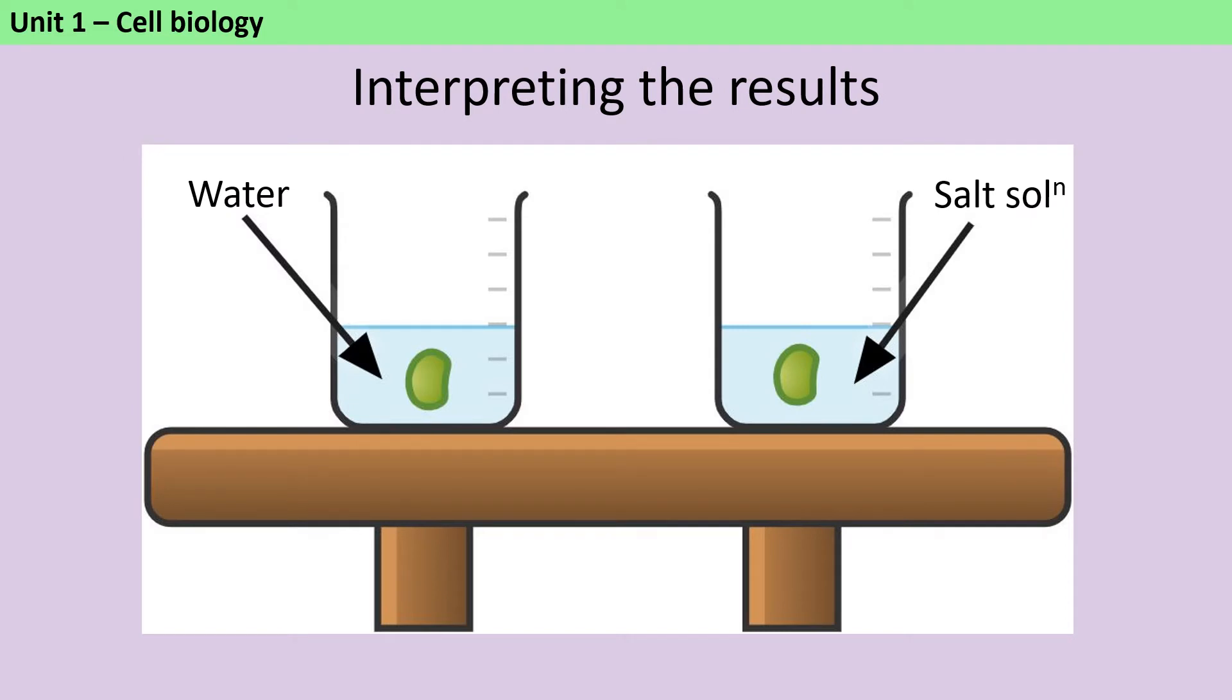When I start the investigation, I'll have nearly identical pieces of plant tissue sat in the different solutions. And then at the end of the investigation, I'm going to observe these, and how they've changed will tell me something about the concentration of the fluid inside the cells of that plant. As you can see, the piece of plant tissue here on the left has got significantly larger and it will also have got heavier, while the piece on the right has got smaller and it's shriveled up. And in both of these instances, the reason that this has happened is osmosis.